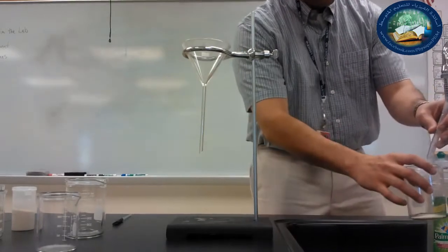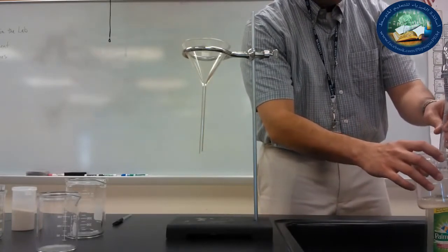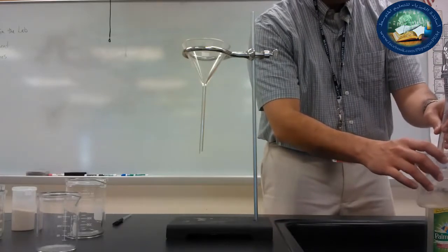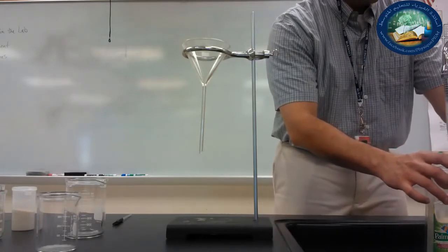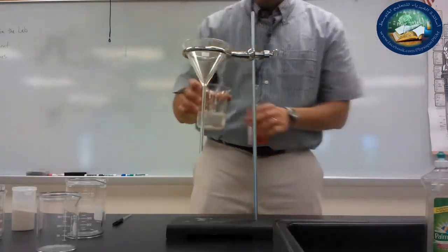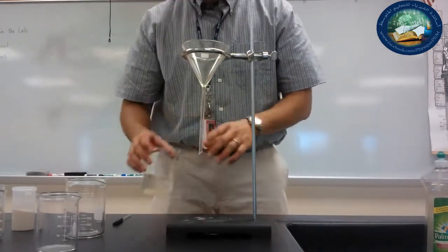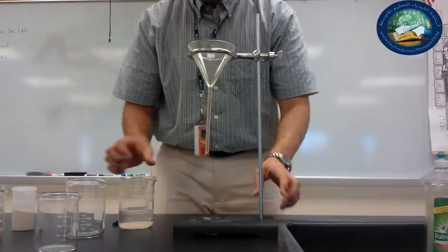And my goal is going to be to separate the sand from the water and to try to recover the water without any sand particles in there. So I am creating here what we call a mixture, right? You can see I've got a setup right here. I'm going to use it later on. I'll explain it in just a second.